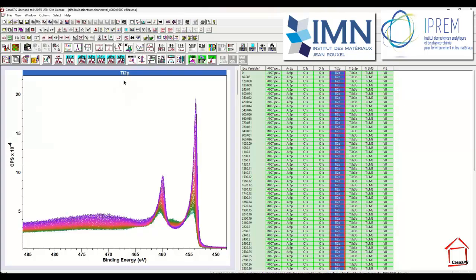In order to gain an understanding of the titanium 2p, we're going to use several options on this lower toolbar, and these include the PCA toolbar button. This will help us to assess the number of different shapes that are significant to these data. It will also provide the basis for choosing the number of abstract factors that we calculate from PCA to reproduce the data.